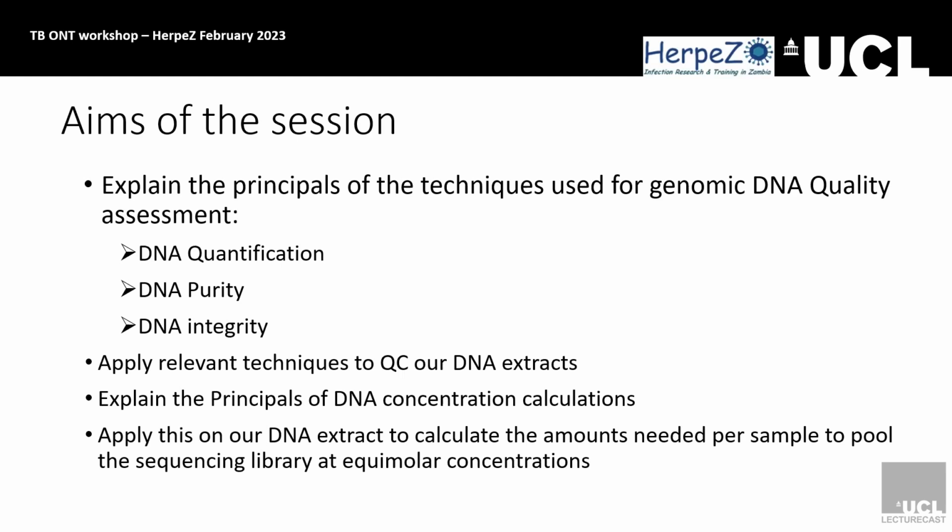And also we'll use the DNA quantification to quantify how much. There's a step where, when you put your samples onto the flow cell, if you have one sample that's got a very high concentration of DNA, and you use 10 microliters of each, what's going to happen when you run is that you get loads of reads from that one sample, and it will outcompete all the other ones. So you want to be able to get enough reads for all your samples, so you want to normalize your concentration.